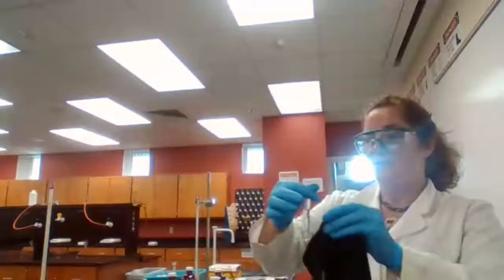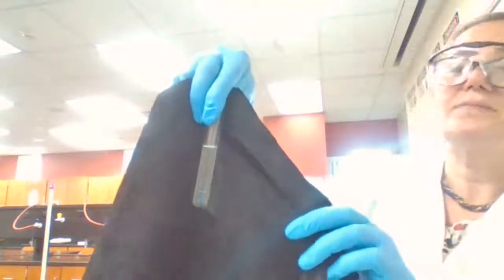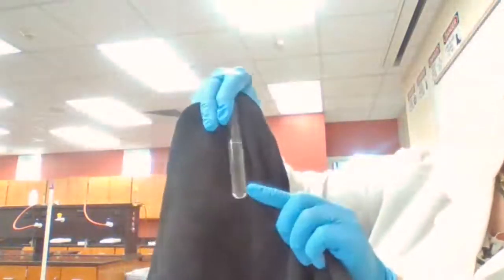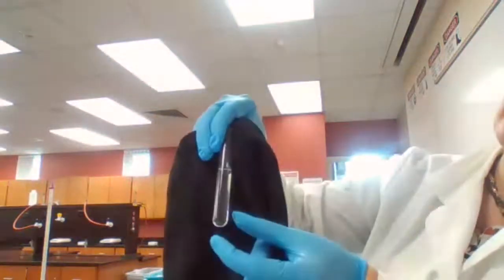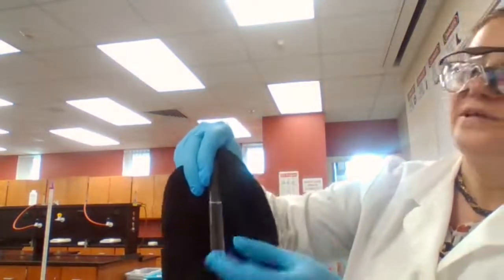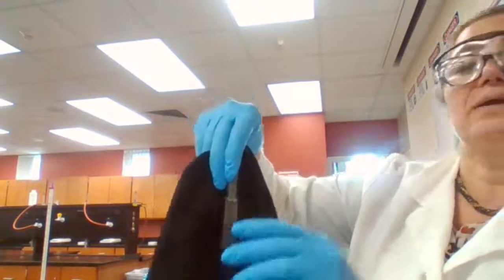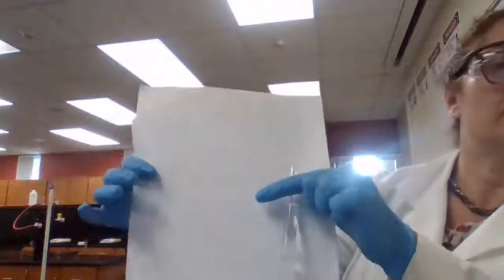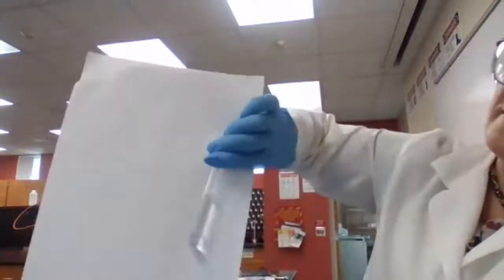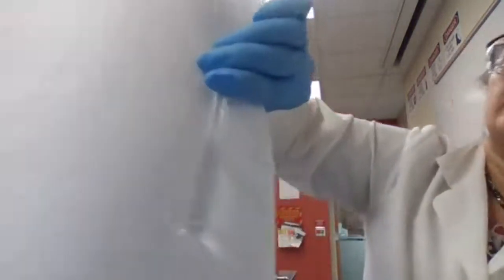What type of background would you need to see this? You can take this as the next screenshot. I want to see if you can see these two layers. One short layer down here, and the top one. Methylene chloride has higher density than water, so methylene chloride would stay down and water would stay up. Do you see it better with the black background or the white background? With the white, okay. With the white background, see the one layer down here, and then another layer up here. So we have the two layers.